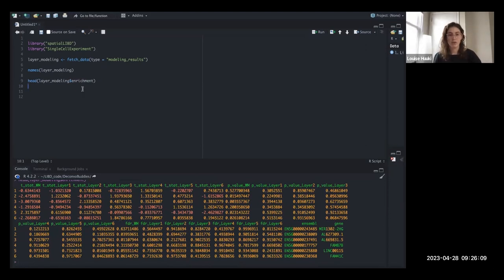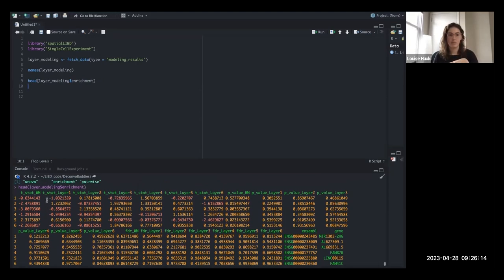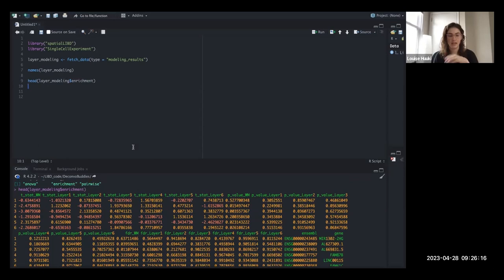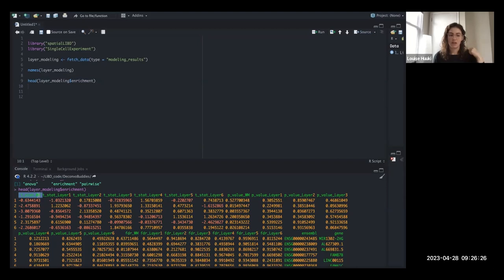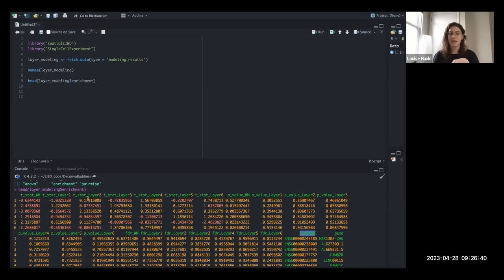Today we're going to focus on just the enrichment model. It's basically a big table of all of the statistics related to that differential expression analysis that was published with that paper. You can also explore all of these online on the Shiny app. Basically what it is: the T statistic for white matter for each gene — how is it differentially expressed in white matter versus everything else. We have the T statistic, the P value, the FDR, and then information about the gene: the Ensembl ID and the gene symbol.